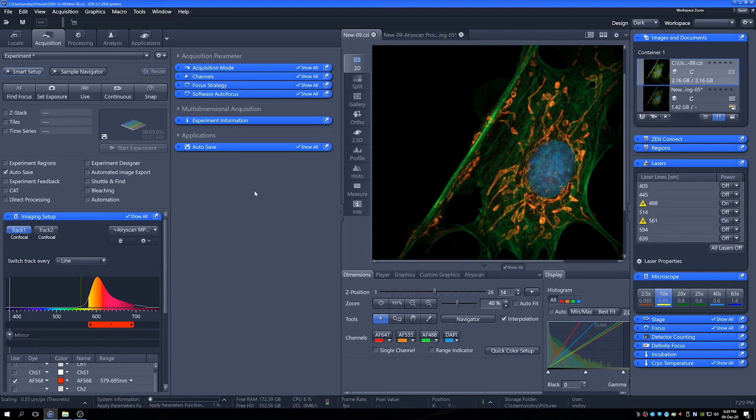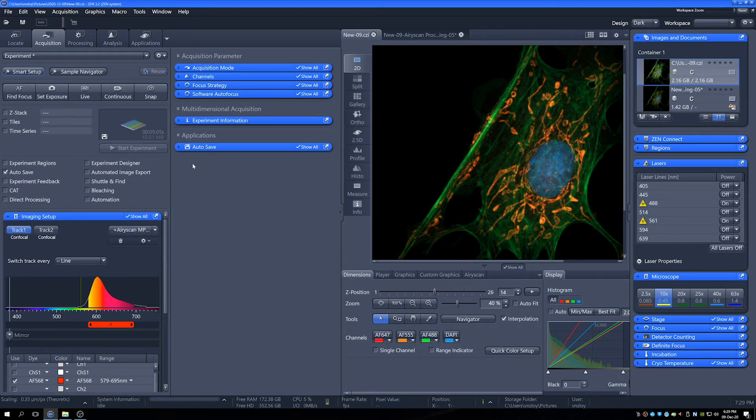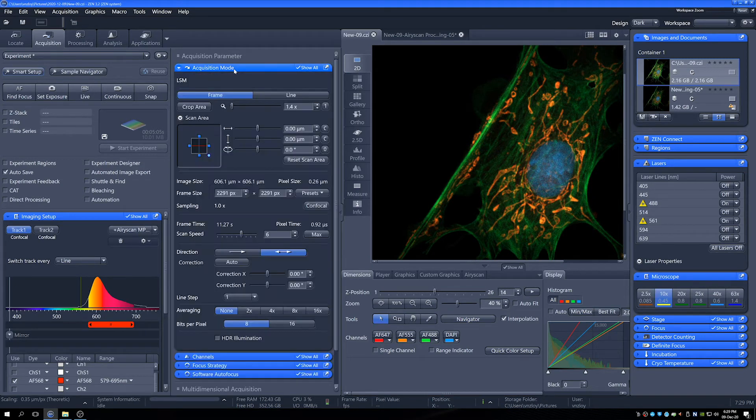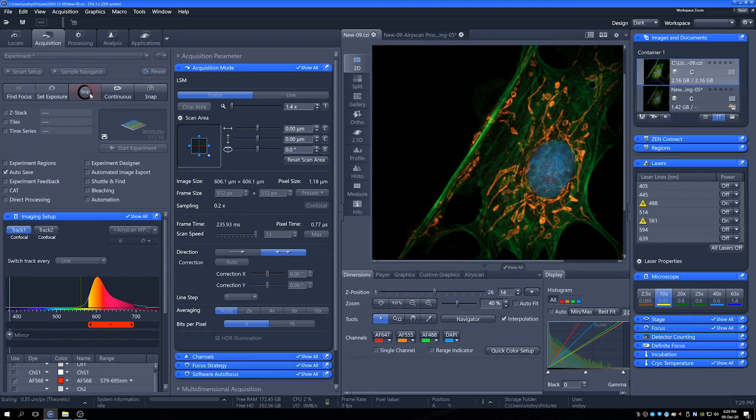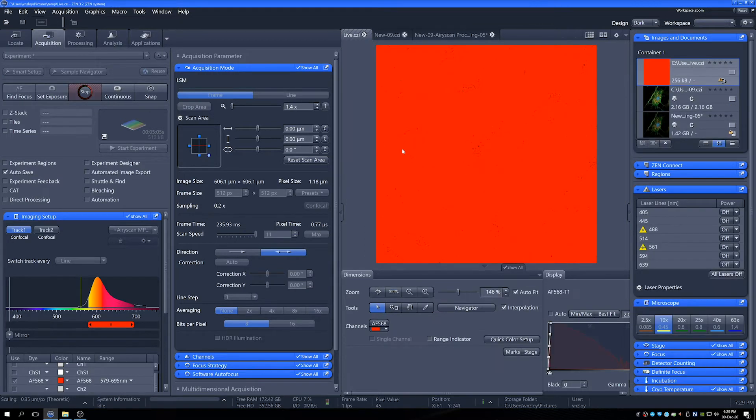Now you can hear the confocal just prepping itself, getting ready to operate in LSM mode. And then if we open the acquisition tab, we can now see all our settings. The first thing to do is to pop it into live mode just to check our focus and see what we've got.